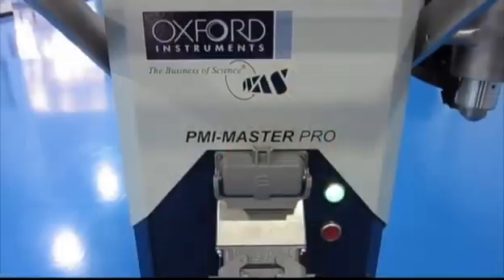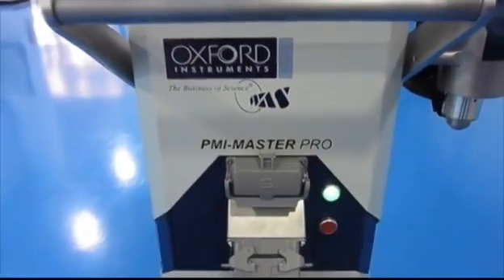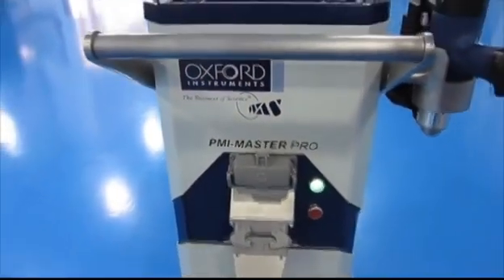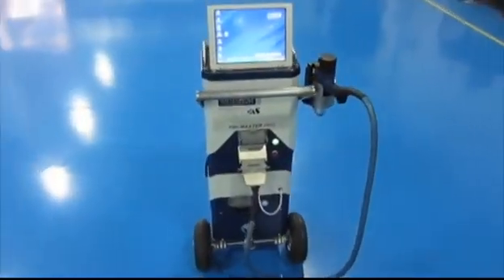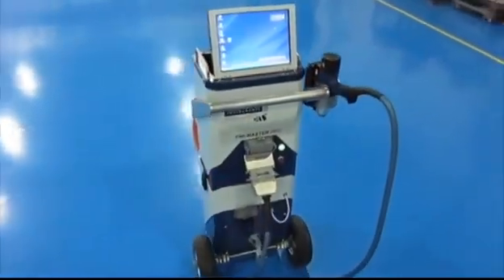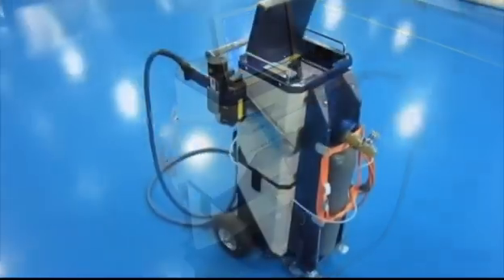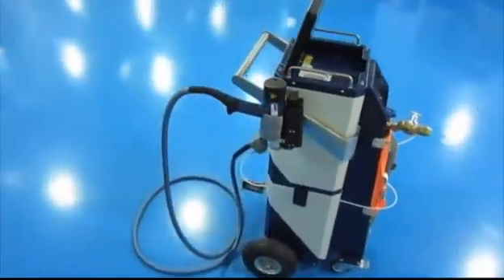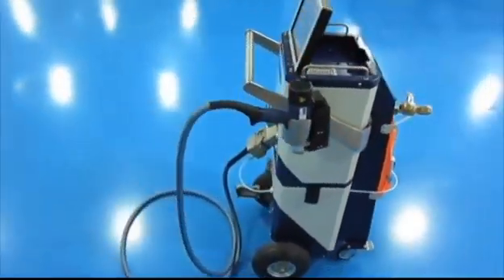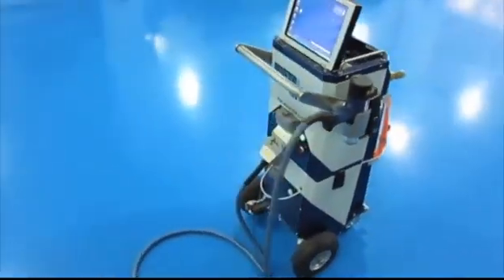When you buy metal components from China, how do you know it's the correct material? Positive material identification is a daily problem in China. We have an Oxford Instruments mobile optical emission spectrometer. In under one minute we can prove if our metals are to specification or not.